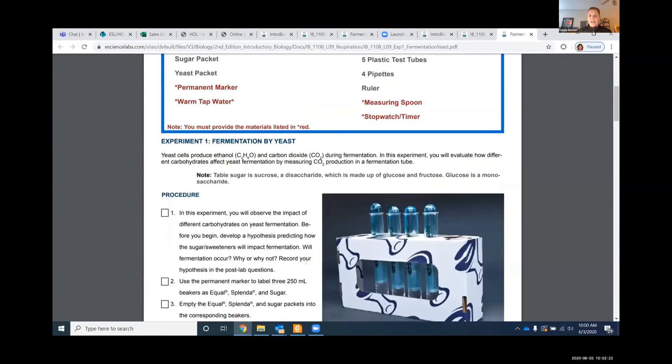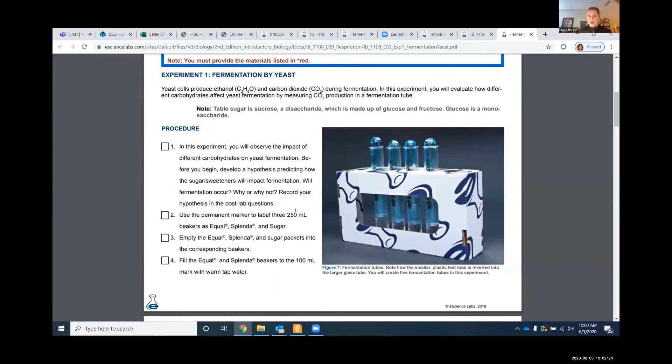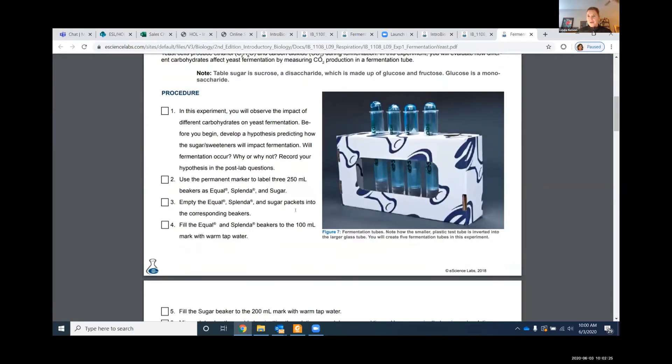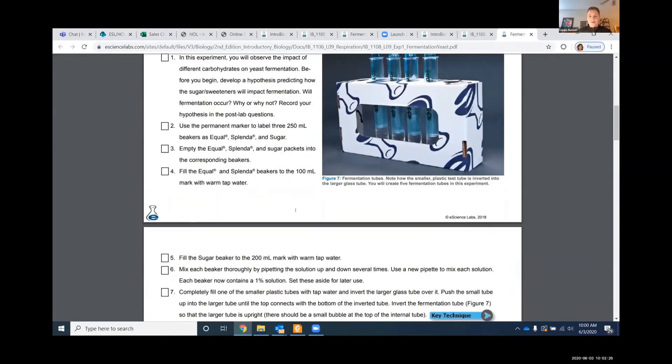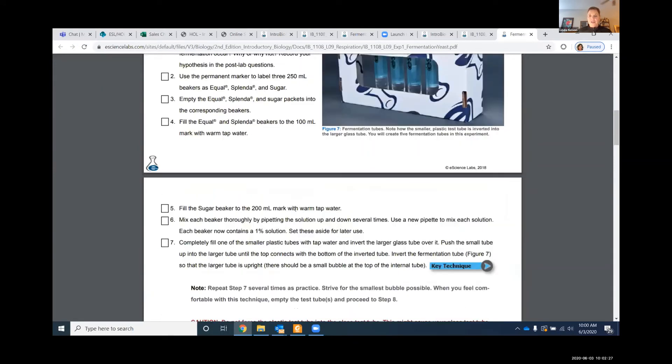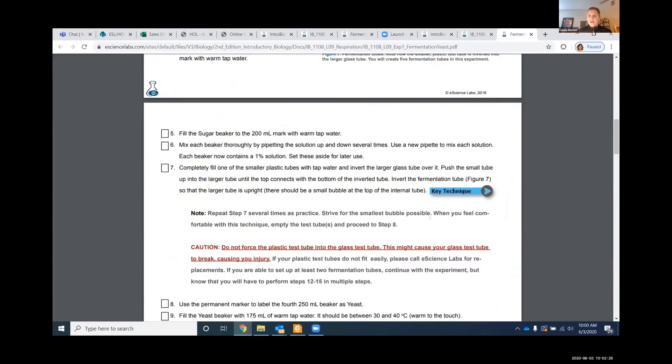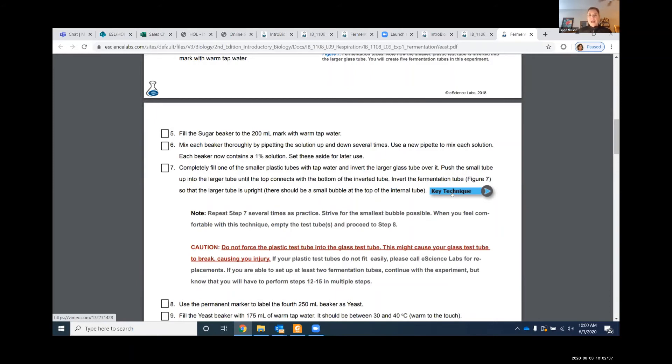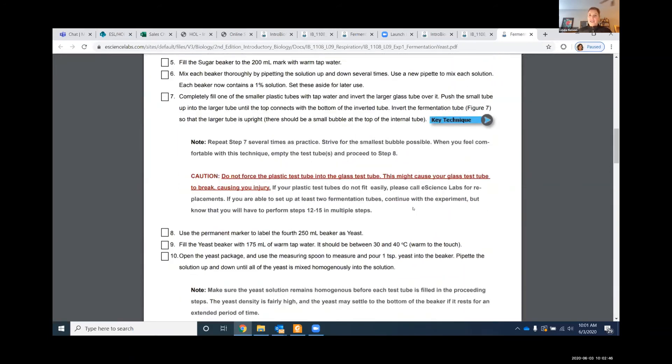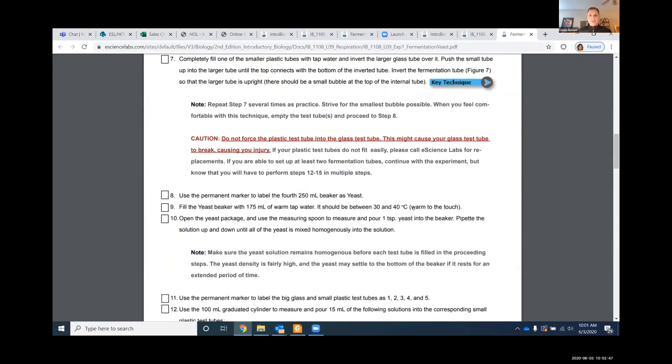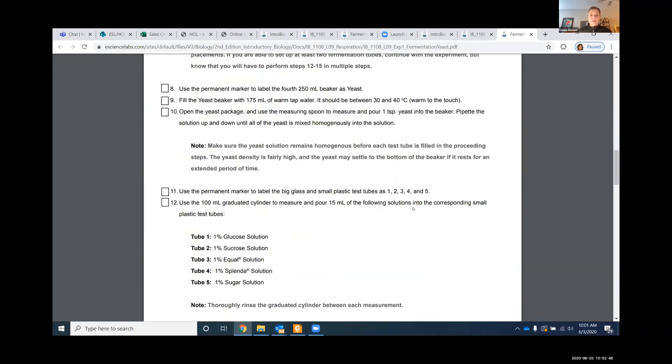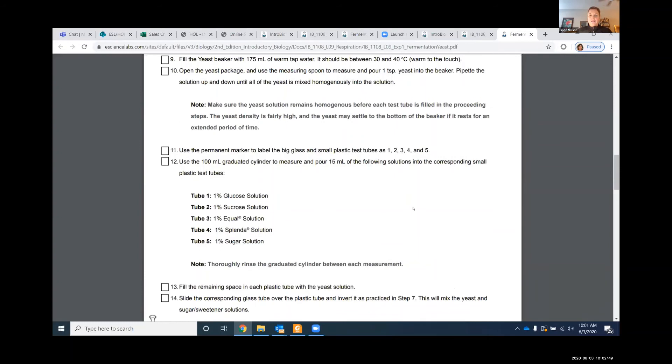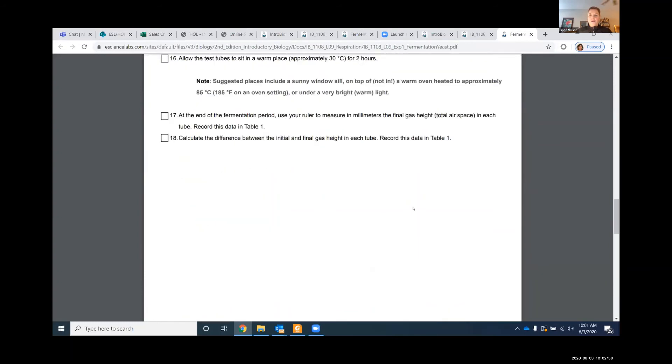Now we're getting down into protocols. Of course, you guys are the subject matter expert with that. From time to time, you'll see a key technique. For sake of time, I'm not going to click on it. It's just a short video clip that tells them maybe how to line up their pipettes or calibrate their digital scale, things of that nature. So continue on through the protocols.